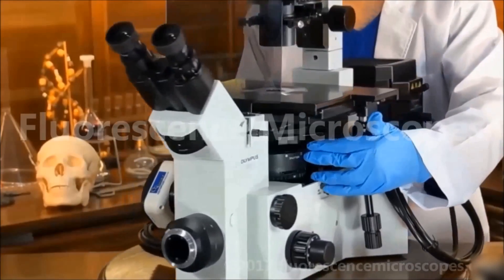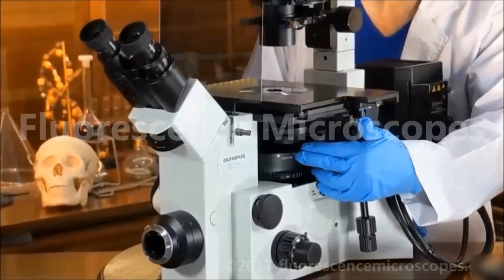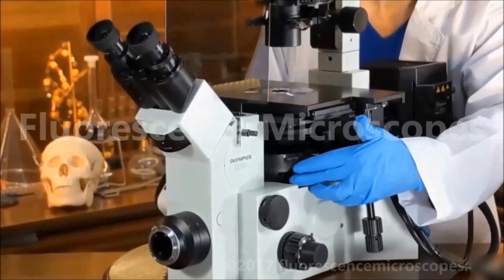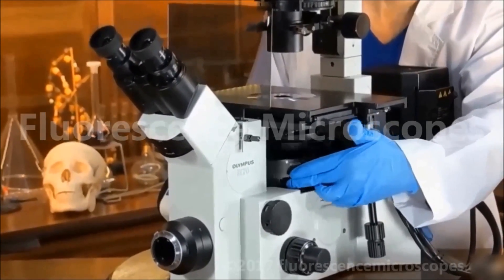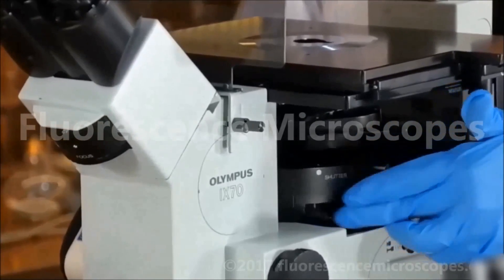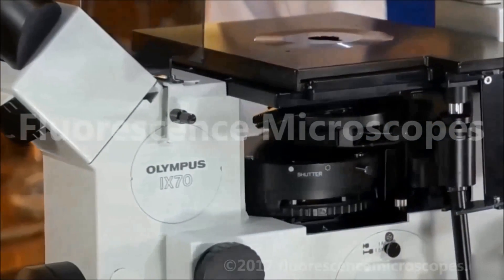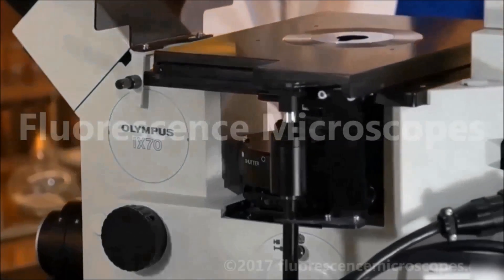This is the reflector turret. It has the dichroic filter cubes. This is the knob for turning and changing the cubes. Making your selection of which cube that you want.